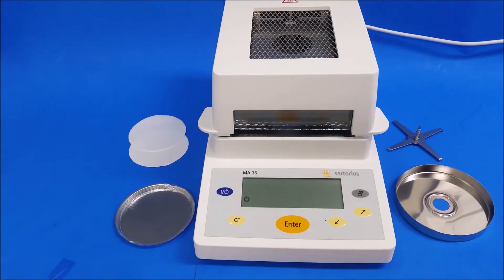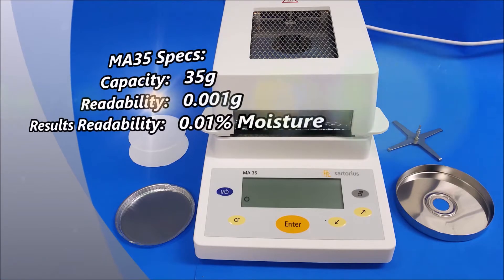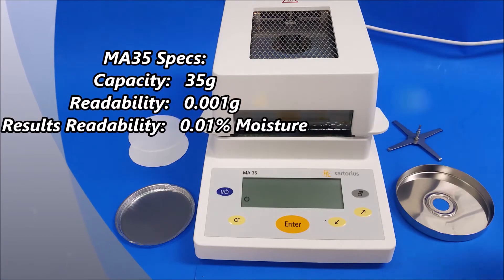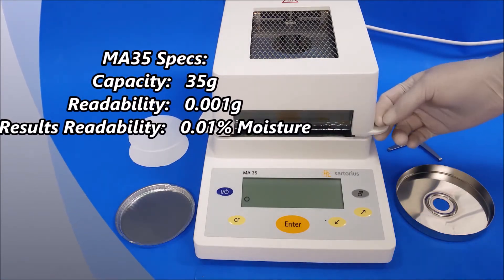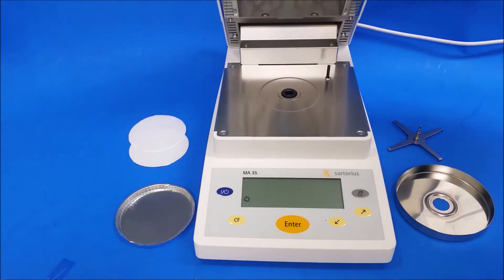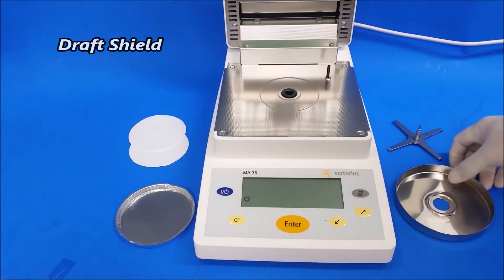Hello everybody, DSC guy here. Today I'm going to show you how to run a test on your Sartorius MA35. First, we're going to put in the original parts. Open up the hood and put in the draft shield first.